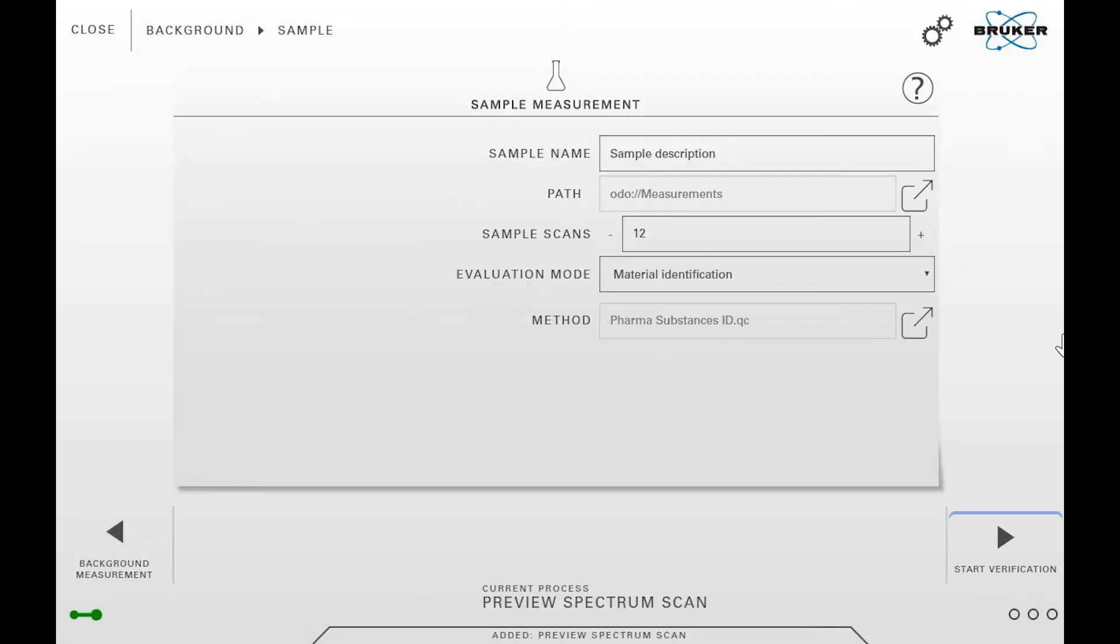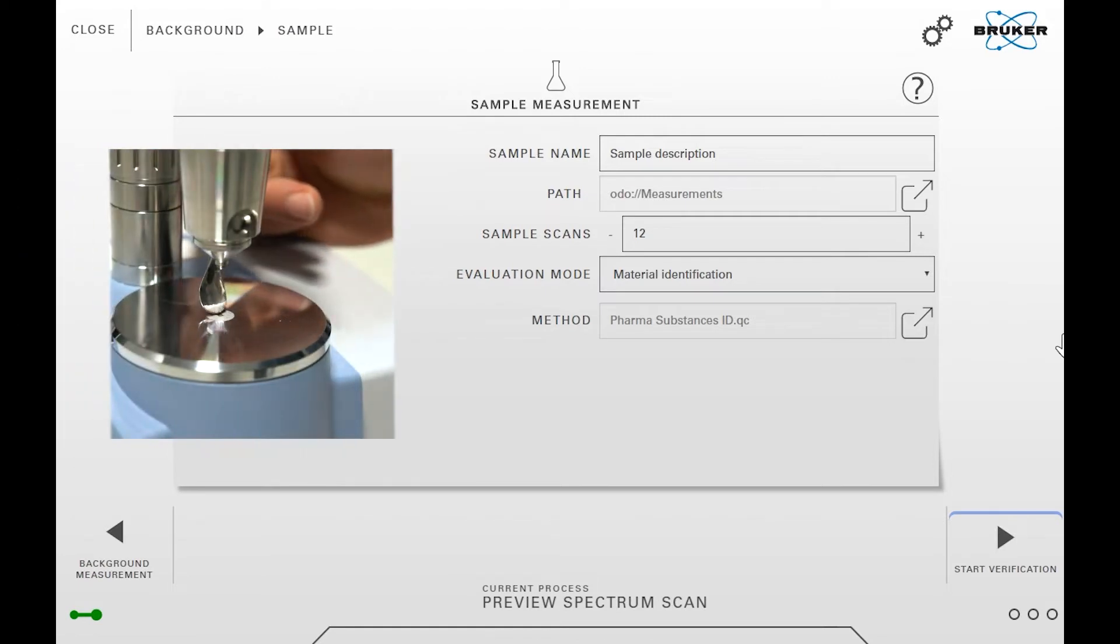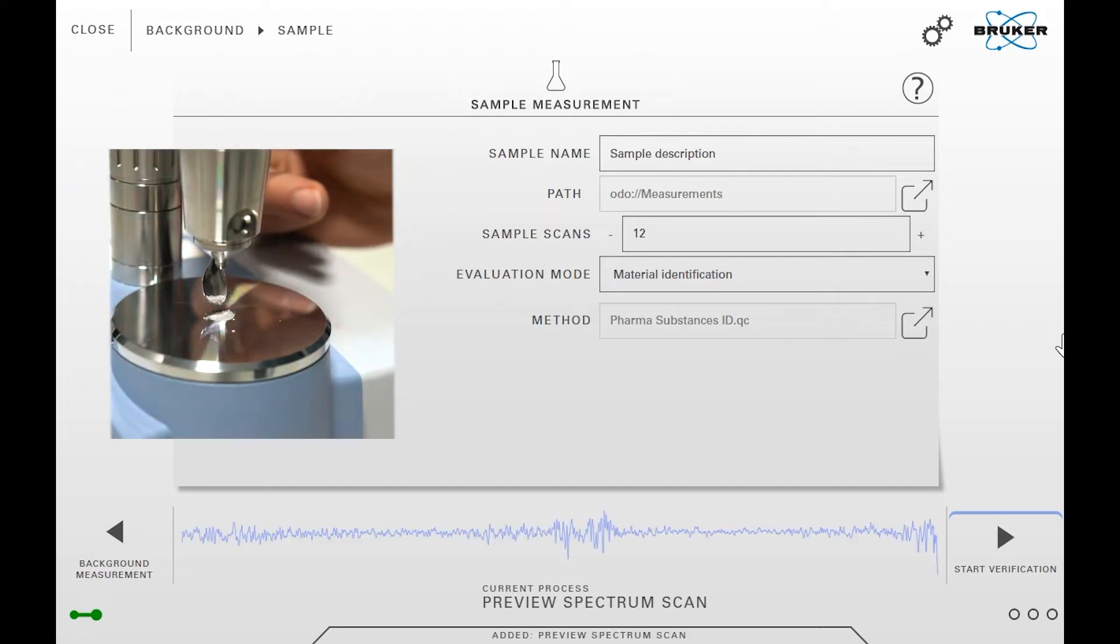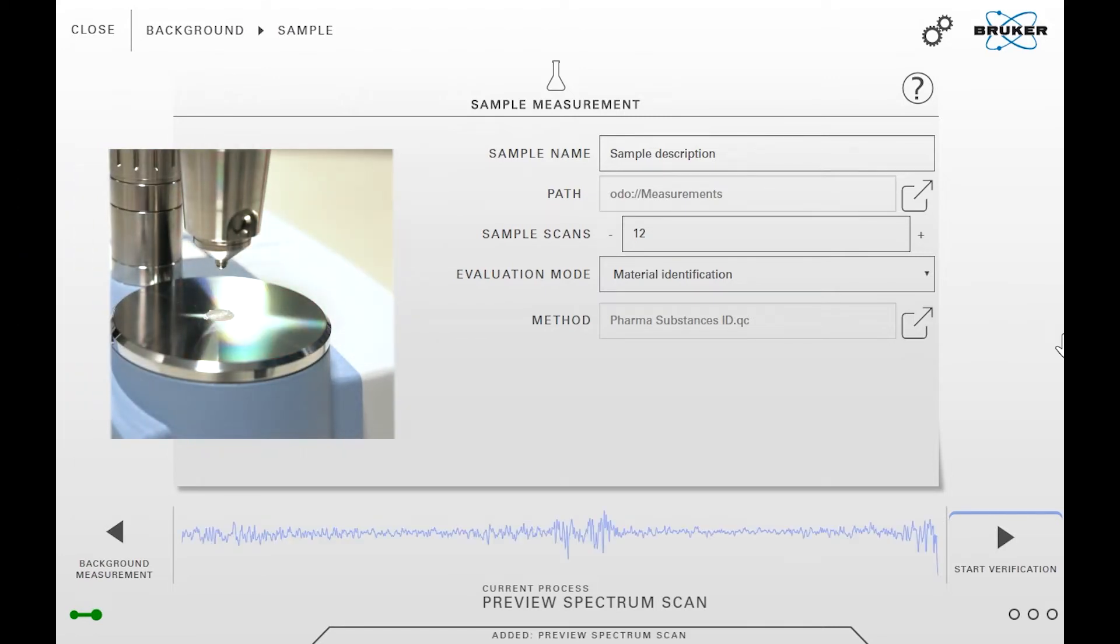When the background measurement is complete, place the sample on the crystal and apply pressure if needed.